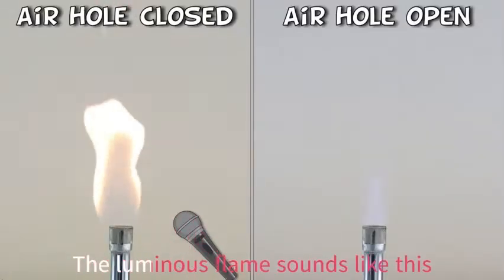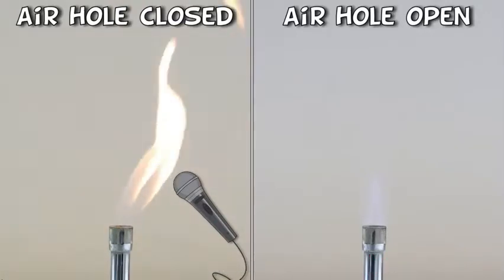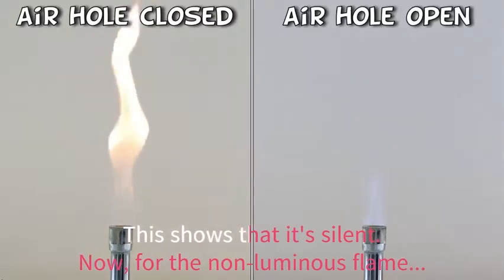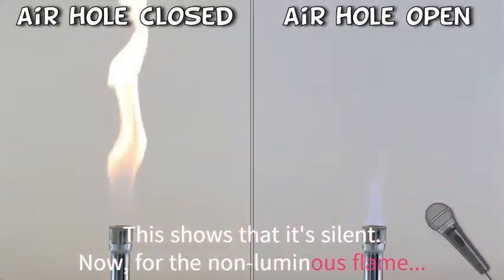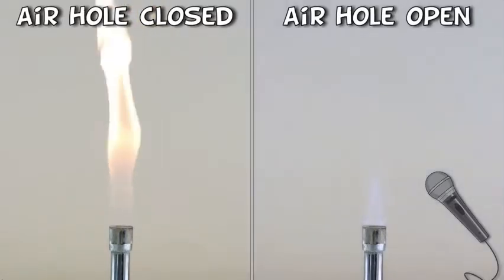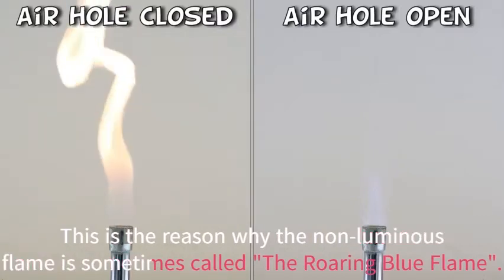What do they sound like? The luminous flame sounds like this. This shows that it's silent. Now, for the non-luminous flame. This is the reason why the non-luminous flame is sometimes called the roaring blue flame.